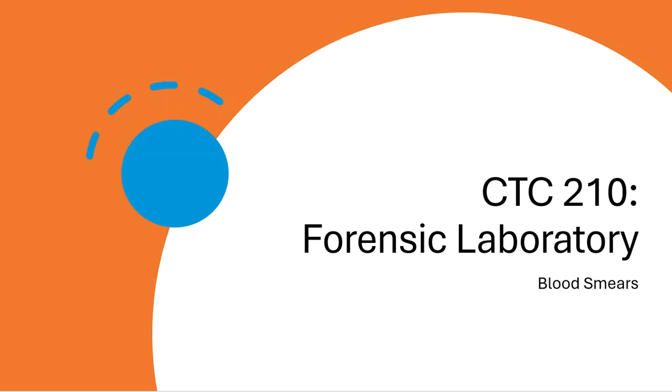So without wasting any more of your time, I'm just going to go ahead and get right to the laboratory clips. So once more, be my lab partner. And then what will happen is that at some point in time, based on your course schedule, we would like for you to come into the lab just for a minute and then analyze some of these slides yourself. That way you can take your own pictures, get familiar with the microscope, and learn a little bit more about technology within the chemical technology program.